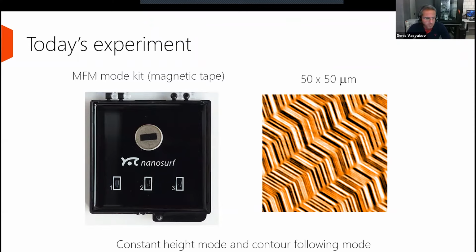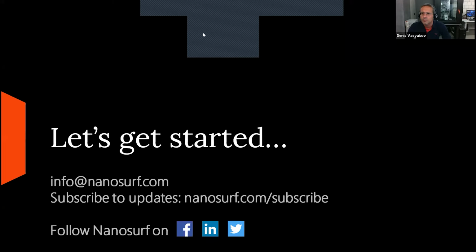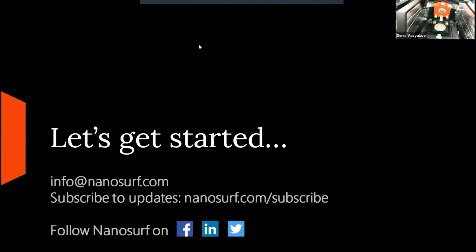But for the demonstration, I will show you how to do both of them. Okay, so let's start. I'm going to show you now how the system looks like. Well, you saw it already in the beginning of the webinar. So now this is the CoreAFM.